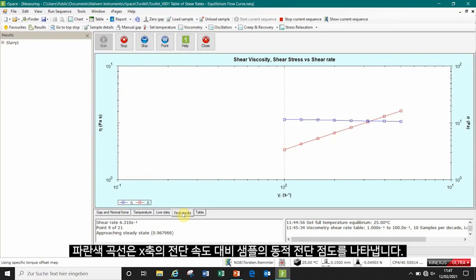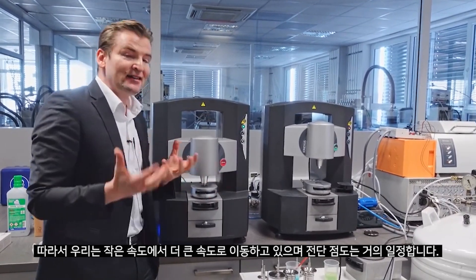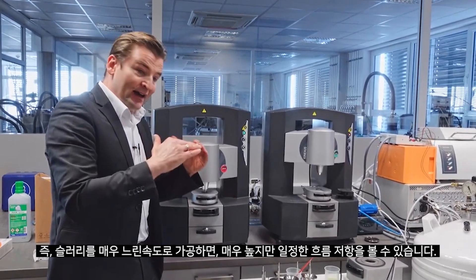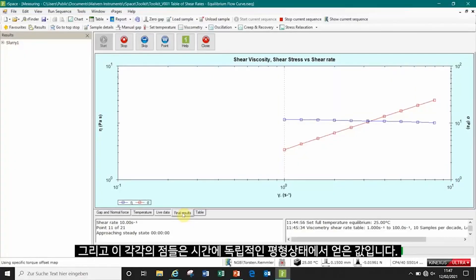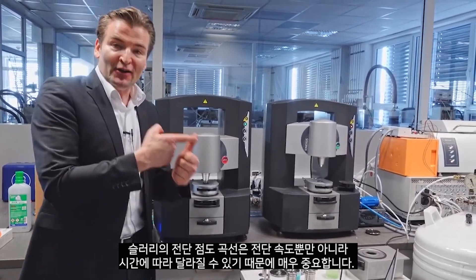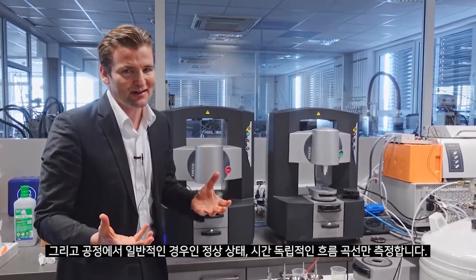You see a blue curve — this is the dynamic shear viscosity of our material versus the shear rate on the x-axis. Moving from small speeds to larger speeds, the shear viscosity is nearly constant. We call this a zero shear viscosity plateau: if you process the slurry very slowly, you see a very high but constant flow resistance that does not change with speed. Each of these points is taken in equilibrium under time-independent conditions. The shear viscosity curve can depend on shear rate but also on time, and we measure just the steady-state time-independent flow curve, which is the usual case in processing.